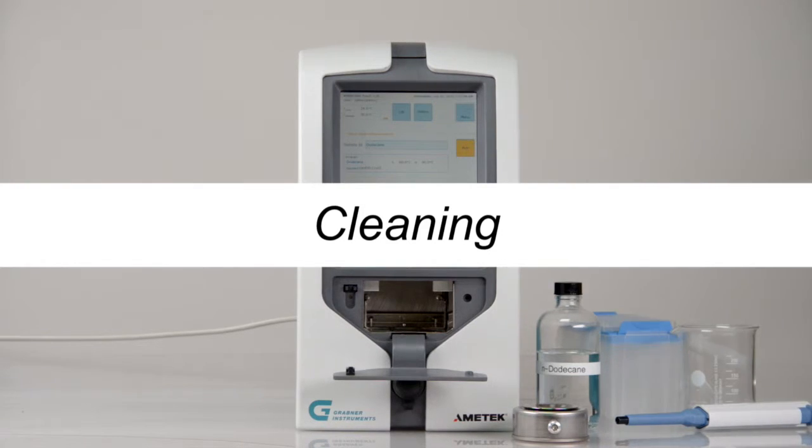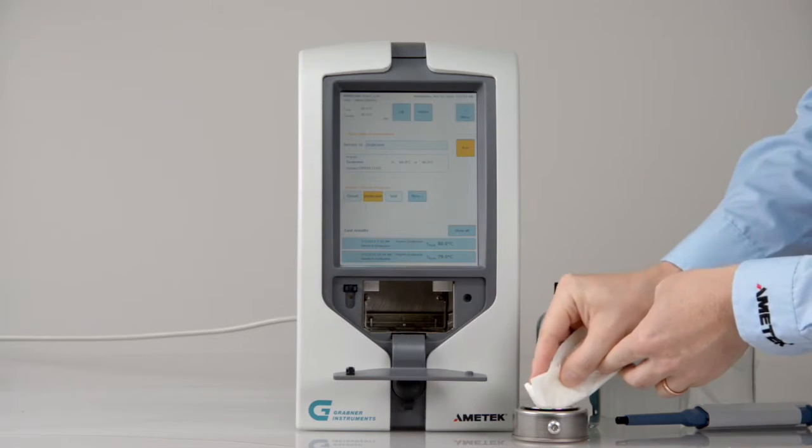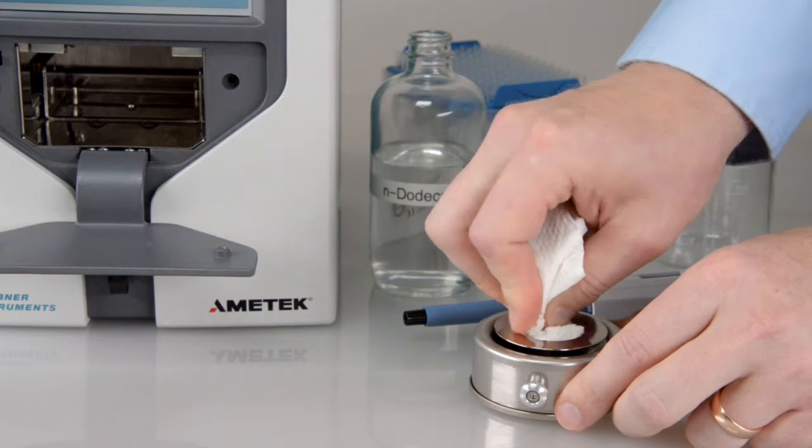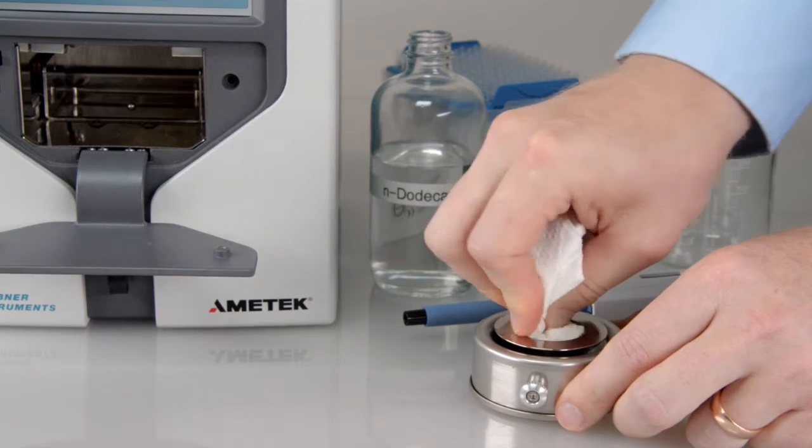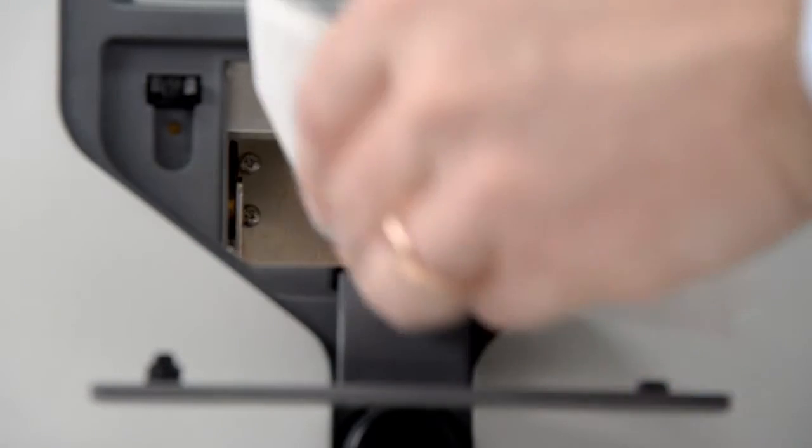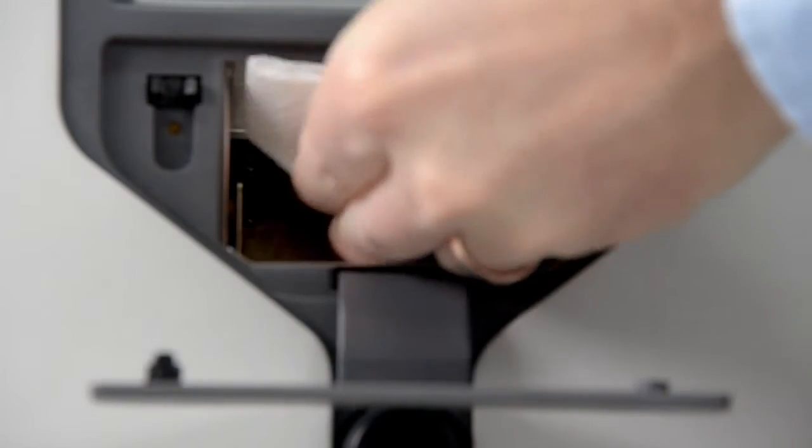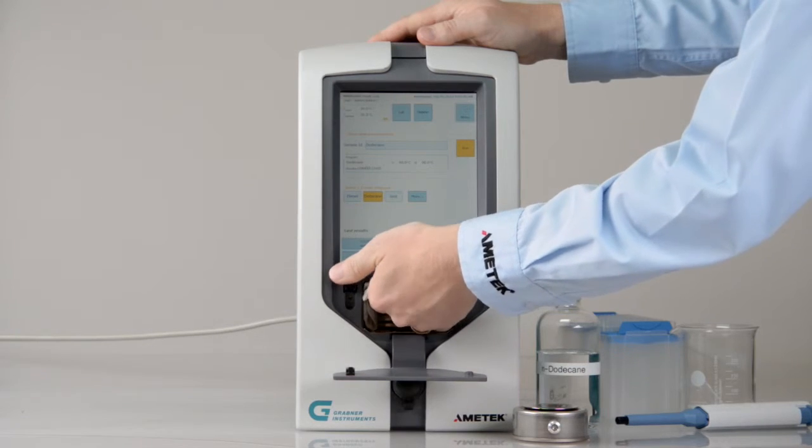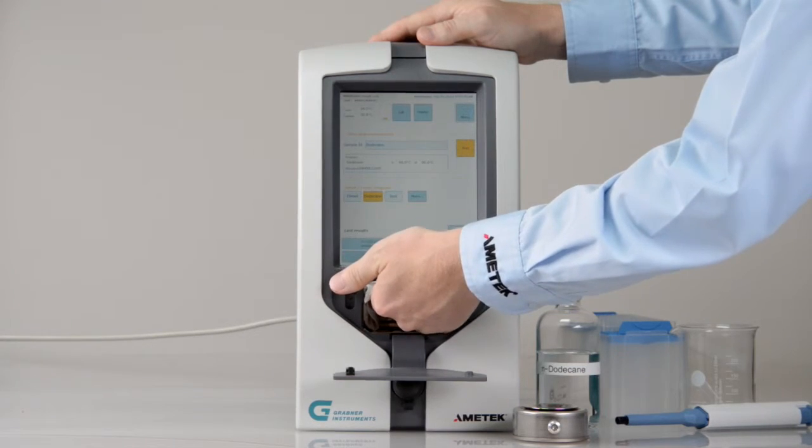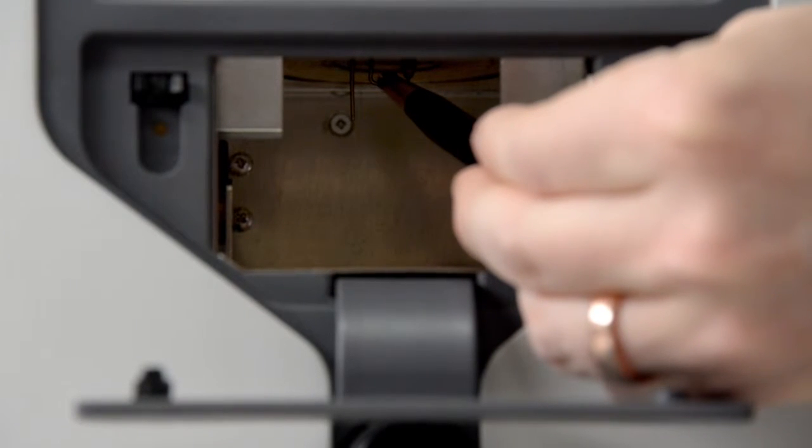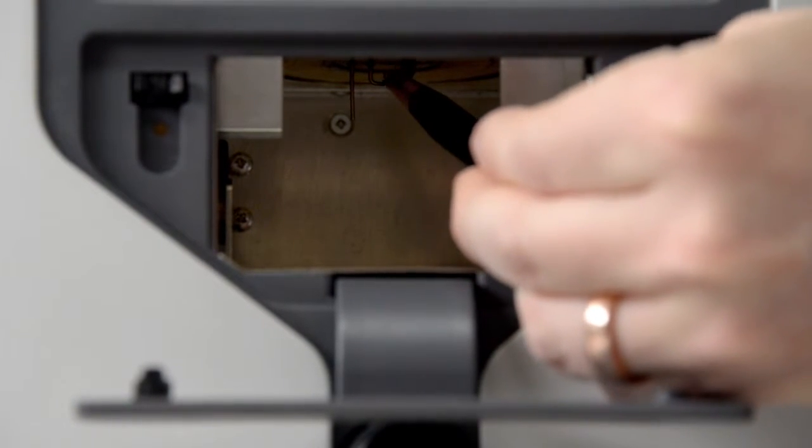Cleaning. After the test, use a tissue to absorb the residual sample and to clean the sample cup. Then, clean the rim of the oven with a tissue. For sticky residuals, use the brass brush.